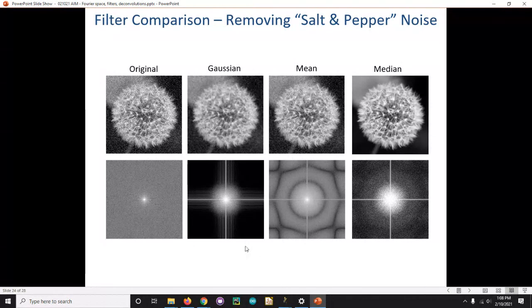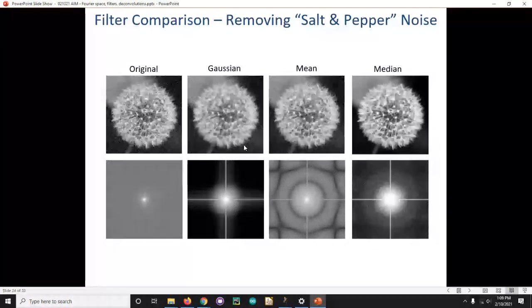And then in terms of denoising, we can see the median filter was the champion, because what these two filters are going to do is take that salt and pepper noise and spread it out and kind of smear it. It's spreading the contamination, as opposed to the median filter, which is effectively replacing that contamination with the best representation of what its neighbors were.